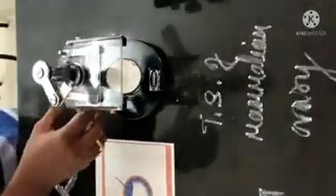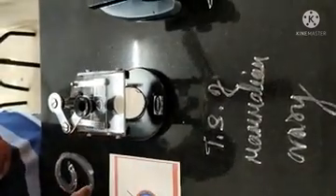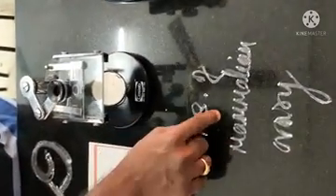Then the third one is the slide. The given slide D is identified as TS of mammalian ovary. For this D, we have two slides. This is the slide called TS of mammalian ovary. See here, I want to give one easy tip: the stained part of the slide is very small. This is one tip. Then the other tip is that this ovary slide is kept under a dissection microscope.